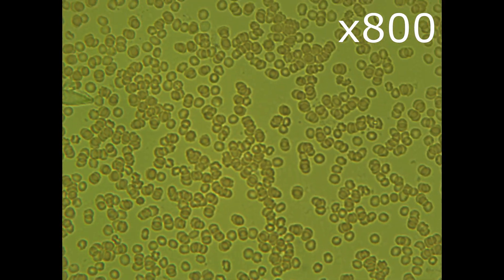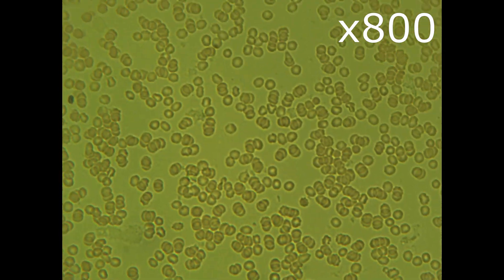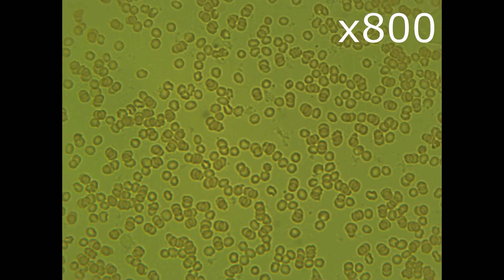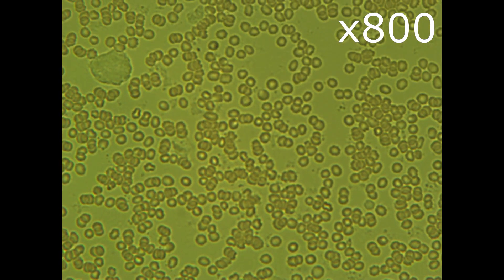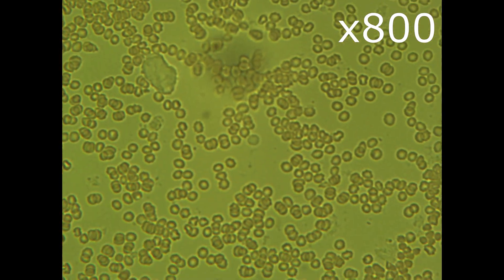Now 800 times. The 800 times zoom gives us a better overview. The chains of glued erythrocytes are not that big and we can also observe some cholesterol.